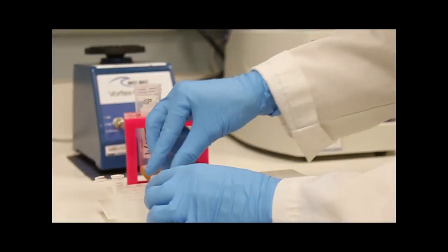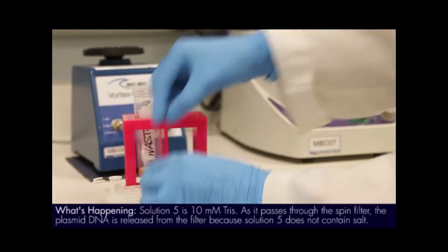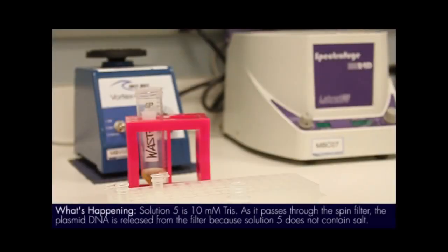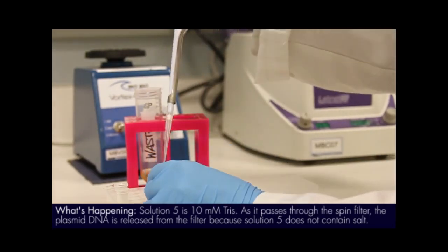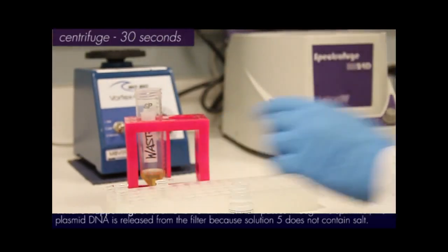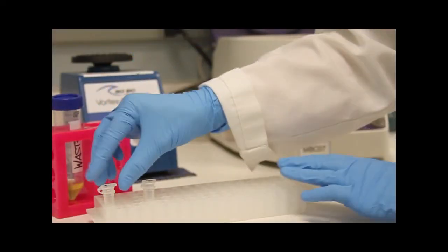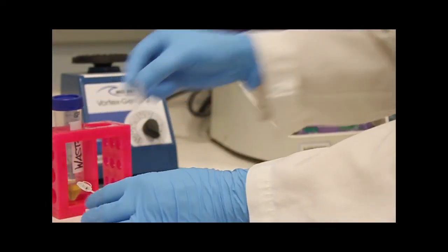We are now ready to elute the plasmid DNA. Be careful not to splash liquid on the filter basket. Place the spin filter basket in a new 2 mil collection tube, add solution 5 or sterile water directly in the middle of the white spin filter membrane and centrifuge at 10,000 times G for 30 seconds. You may now discard the spin filter basket.